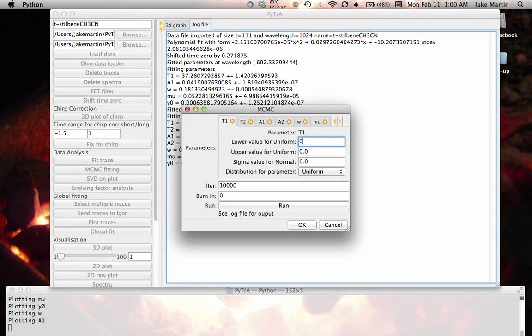Let me just do this quickly. So we'll choose about 5, maybe up to 10. Here we're trying to see if there's any parameter around 3. And here we'll go from, say, 5 all the way up to 100. So this is our 40, round about 41. And we know it's going to be positive, so it's good to do that. This is going to do that.